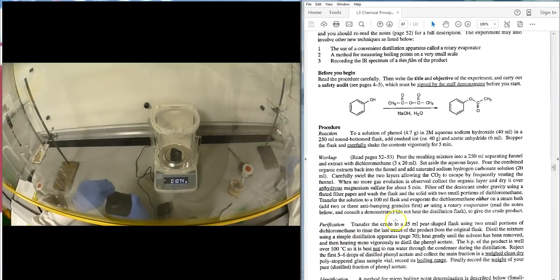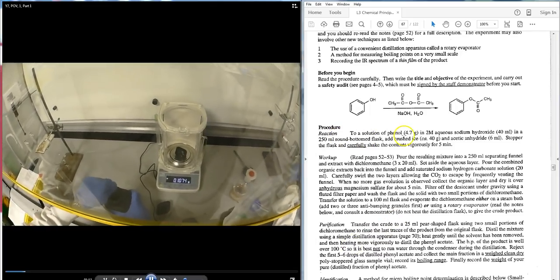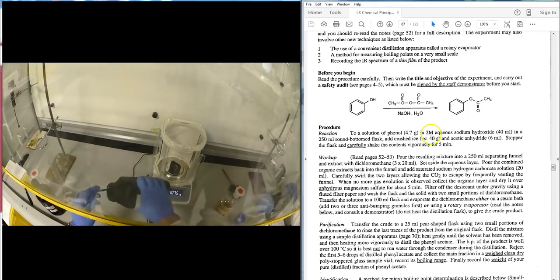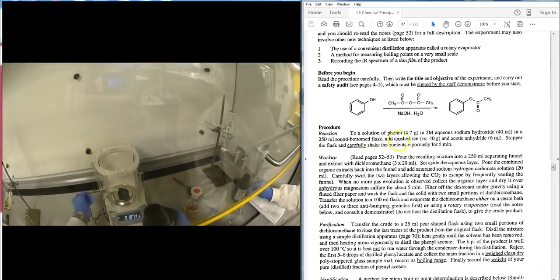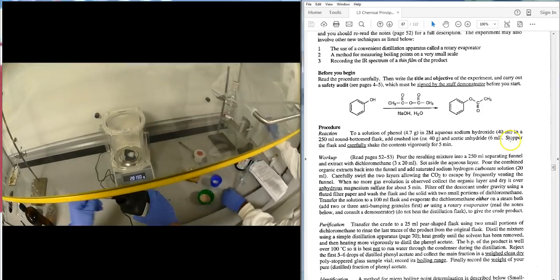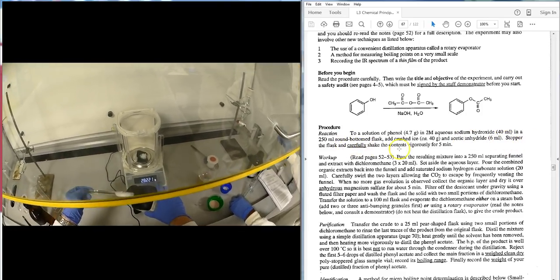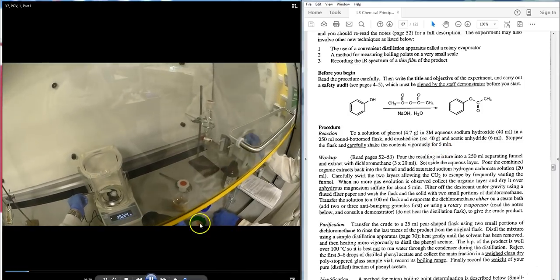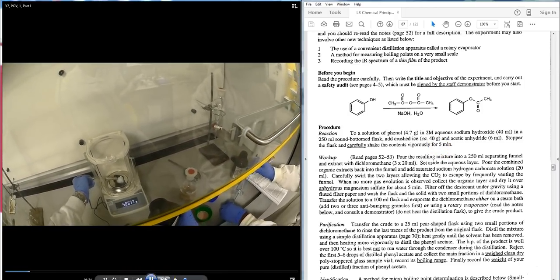The reaction involves a workup and a purification step. The student has already started, taking phenol at 4.7 grams, placing it with 2 molar sodium hydroxide at 40 mL in a 250 mL round bottom flask, adding crushed ice, and then carefully adding acetic anhydride. The flask is stoppered and the contents shaken for five minutes.